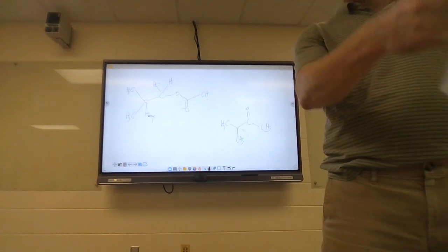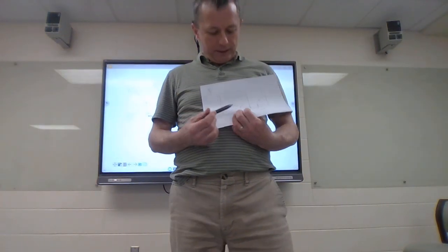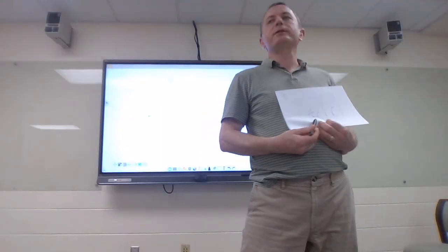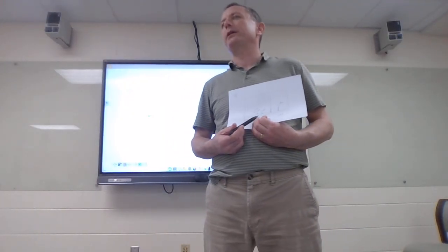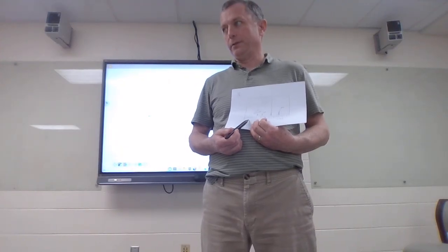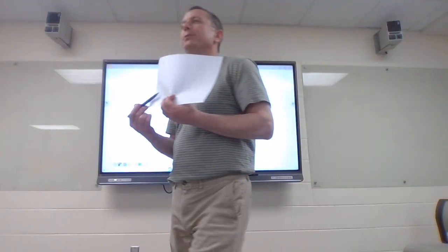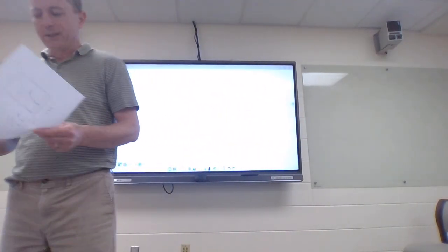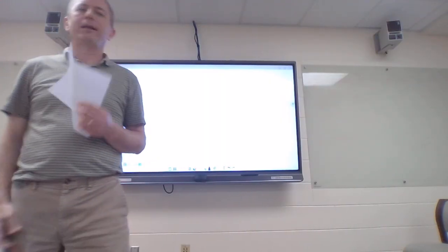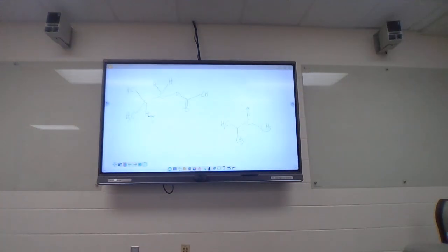9 and 10 are a little bit trickier. I'll say one thing about 9 real quick. 9, these 2 peaks down here, I did this to give you an example of a spectrum that has hydrogens on a carbon-carbon double bond. So this is coming from an alkene. So I wanted to give you examples of different things. This is one with an alkene. 10's mean. 10's got an epoxide in it. I like it, but you're not going to deal with too many epoxides.